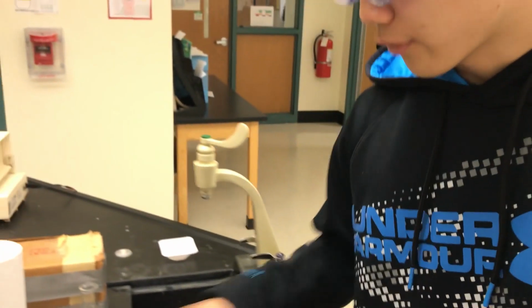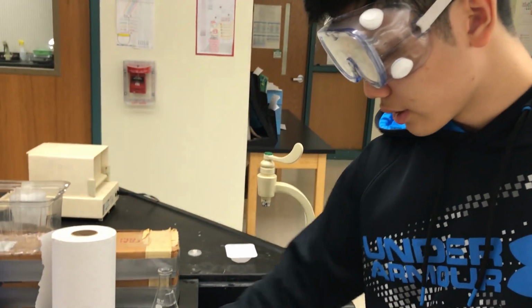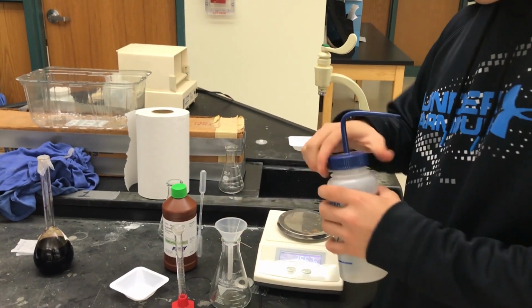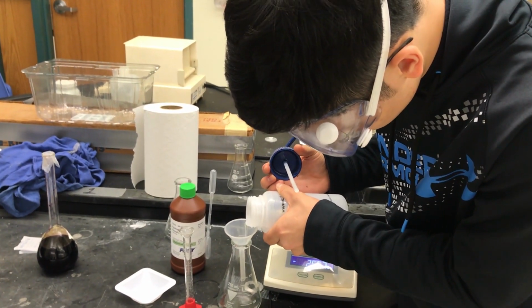Alright, hey guys, so for our next step for this lab, we have to use hydrogen peroxide for our actual titration. So our first step is to get a 250 milliliter Erlenmeyer flask and put another 50 milliliters of distilled water in. Doesn't have to be exact, but at least close.